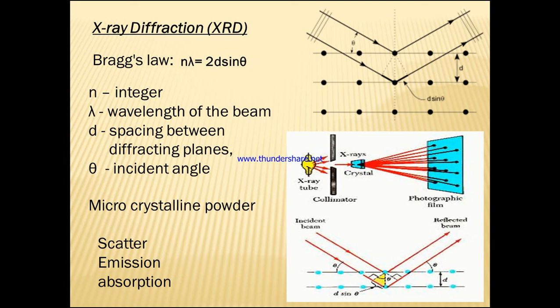Based on the geometry of X-ray diffraction, the sample rotates in the collimated X-ray beam at an angle. The X-ray detector is used to detect the X-rays, their angle as well as their intensity, and based on that we can analyze the material or the sample here. For this rotation we have a goniometer, as I have told you. It is the instrument used to maintain the angle and the rotation of the sample.